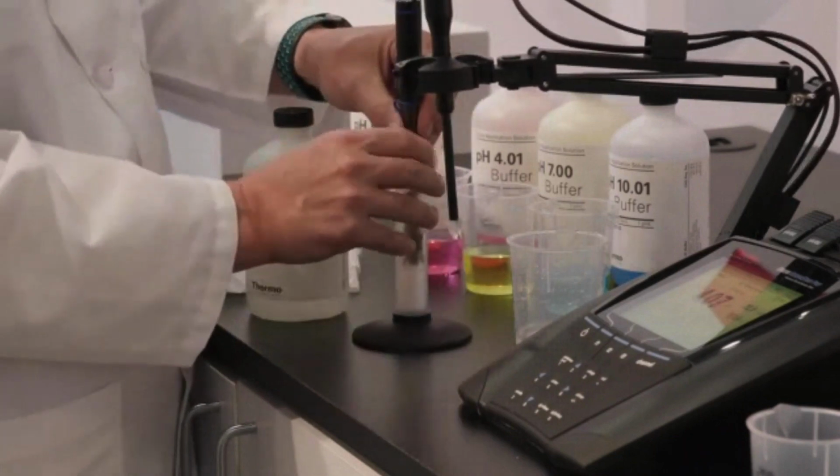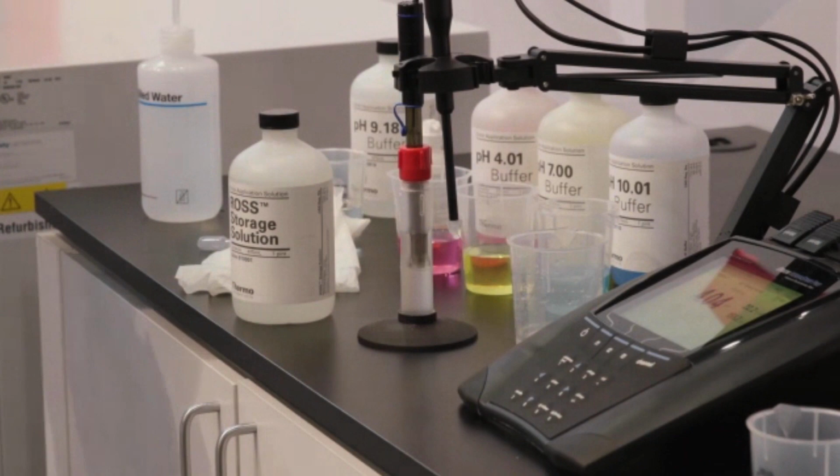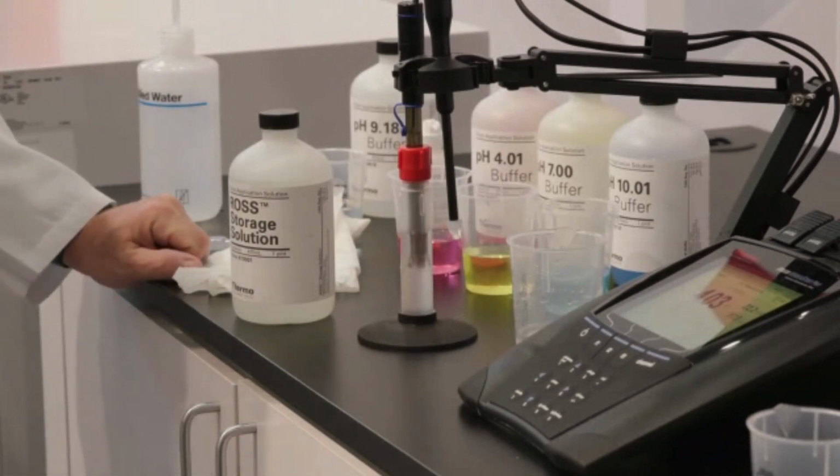Great. Now the storage solution itself should be changed periodically. So all we need to do is dump the storage solution out. We can do a quick rinse with some reagent grade water and then refill it. And for similar reasons as with the electrode fill solution, we want to avoid evaporation of the storage solution and avoid contamination. If we've put an electrode in there that wasn't completely clean, we want to avoid it evaporating and making crystals, and we don't want any mold growing in there and messing with our electrode.